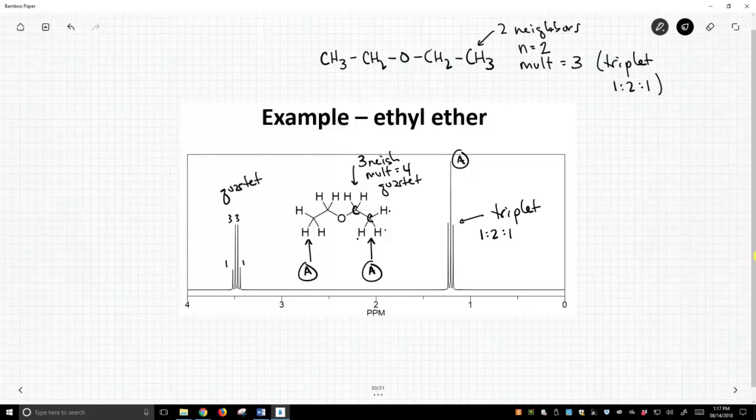So these hydrogens in this molecule, whether we're talking about the methyl group or the CH2 group, they are really different. They have a totally different peak shape. Those signals for those hydrogens have a different multiplicity. And when we look at the spectrum, it's very apparent. Oh yeah, that's a pattern of four. That's a quartet. That is a pattern of three. That's a triplet, and it even has the right intensity levels. So let's look at another example.